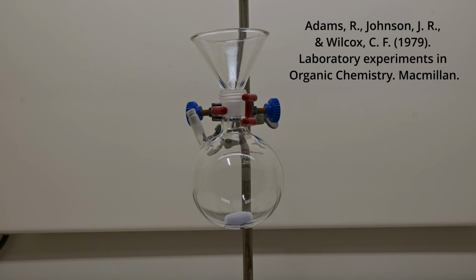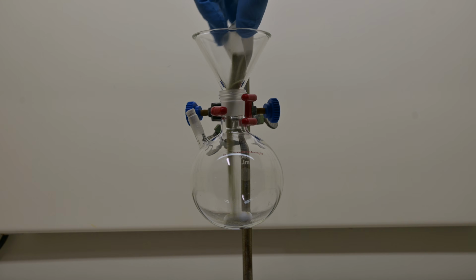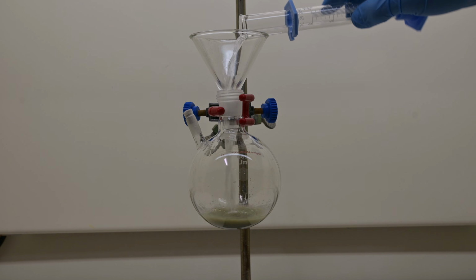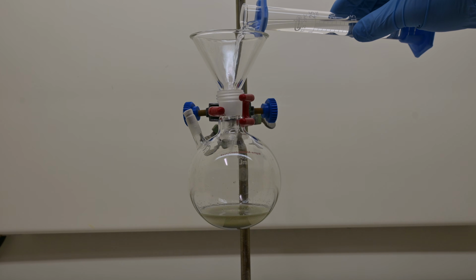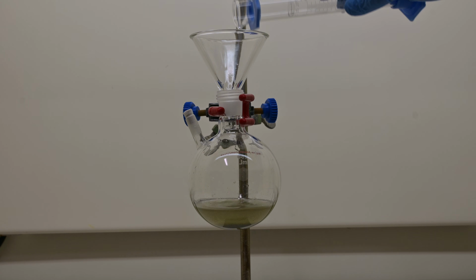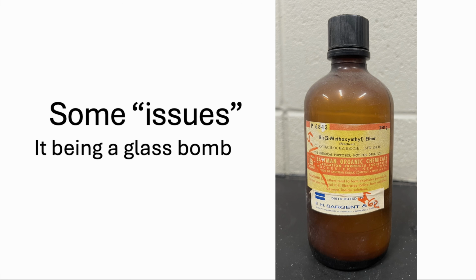We can now start our triptycene synthesis by grabbing a 250 milliliter round bottom flask and dissolving 1.8 grams of anthracene into a mix of 20 milliliters of acetone and 20 milliliters of 1,2-dimethoxyethane. We can also refer to this compound as glyme for short. We went with glyme because we had some issues with the bis(2-methoxyethyl) ether.